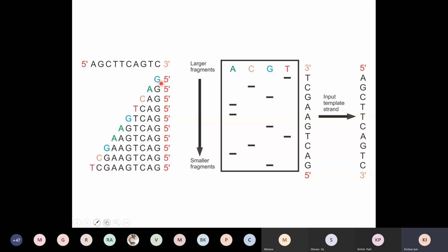Okay, so the dideoxy GTP tube will have a strand which stops here, and when it stops here, I'll get a piece which is the shortest, which will be in that tube where I added dideoxy GTP. But this tube will also contain 2 more pieces. Okay, and what are those pieces?